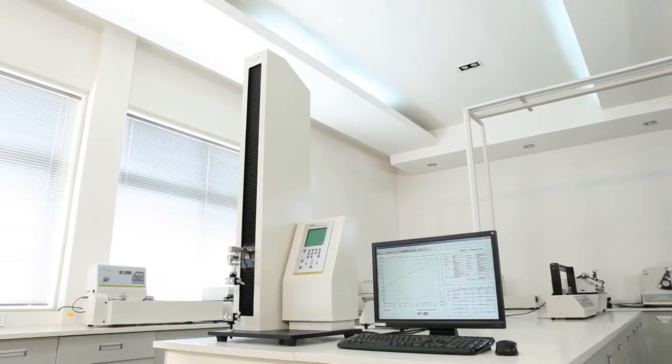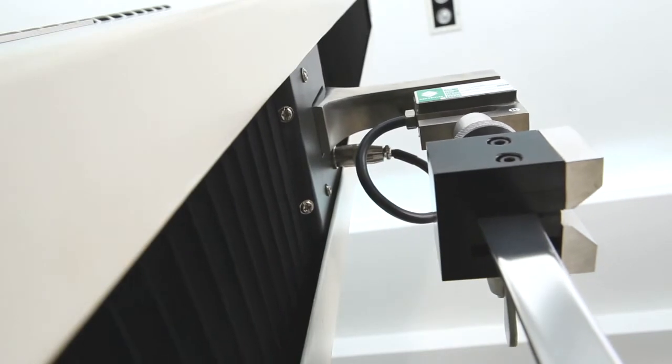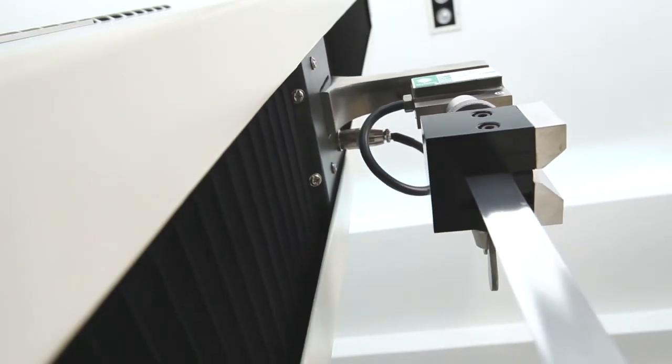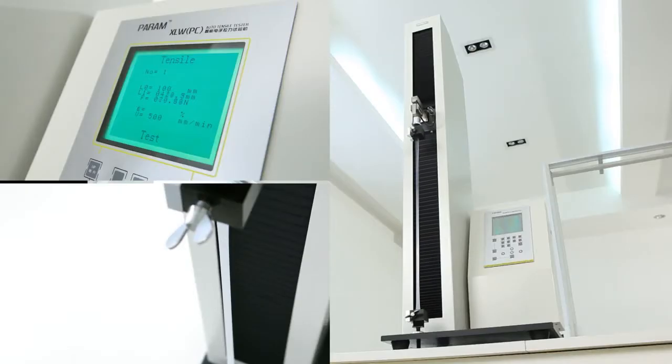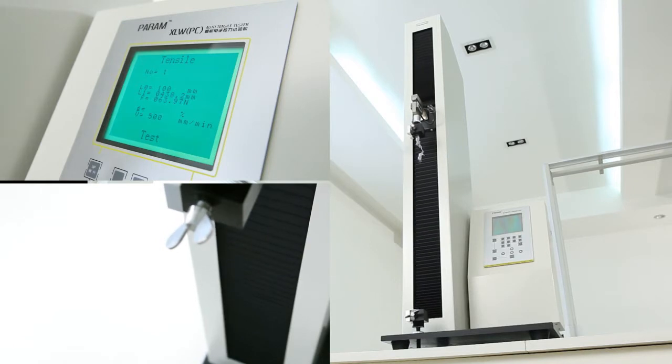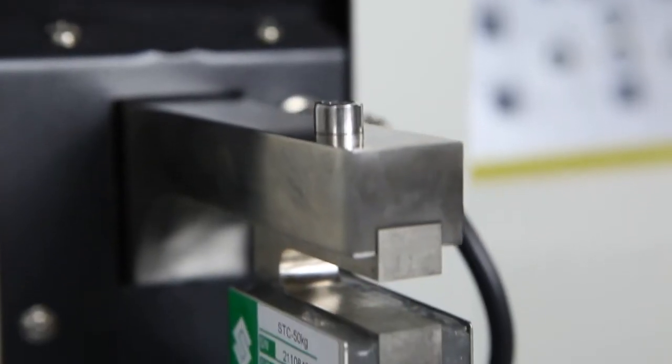XLW-PC is LabThink's latest generation of intelligent automatic tensile tester. The extra-long 1,000 mm stroke can satisfy the extreme deformation testing need of all types of packaging materials.